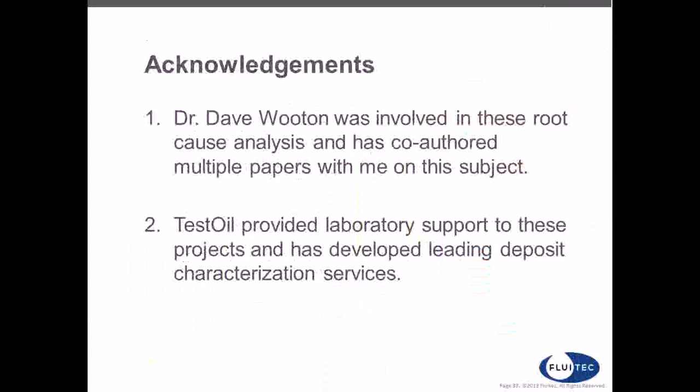Greg, the first one is, in an EHC system that has a PAG fluid, EcoSafe, which has no hydrocarbon in this fluid, what can cause a varnish-like deposit, which was characterized as being a carbon deposit?